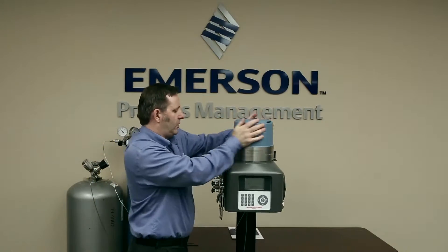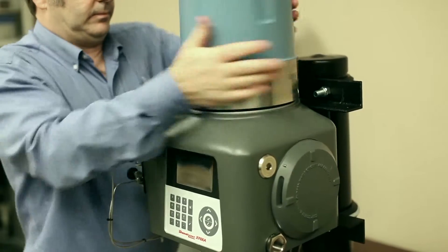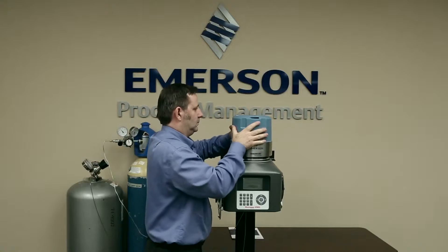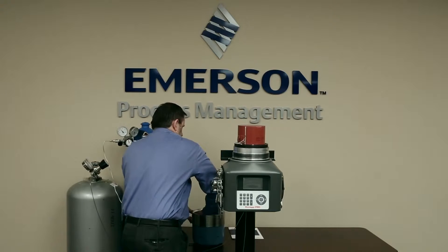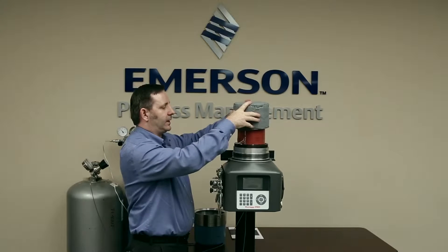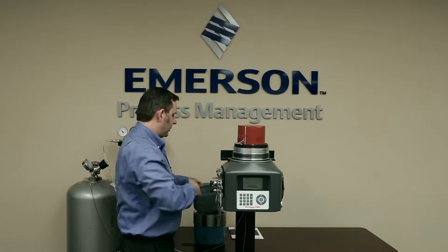Now I've loosened the lock screw, I'm going to unscrew the dome. And here we have the analytical module. Sometimes when you take it off, the insulated cap will stay on the analytical module, or sometimes it'll come off with the lid.